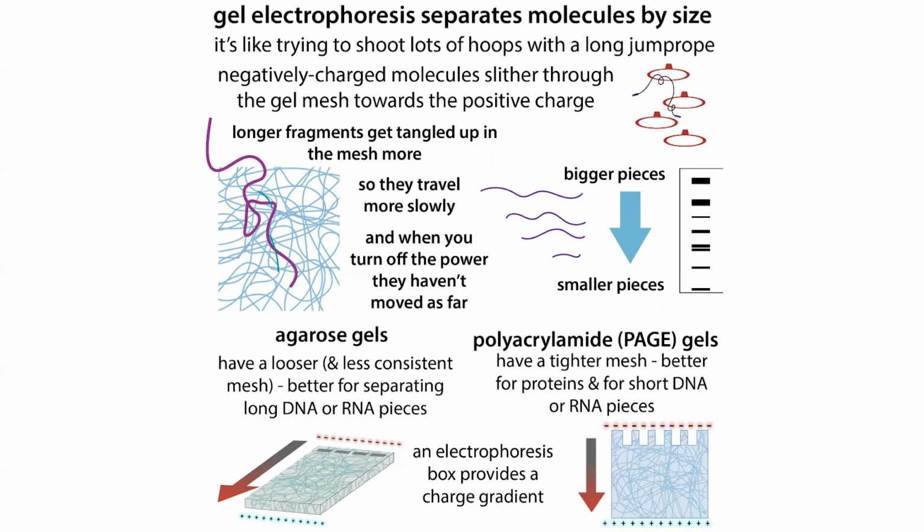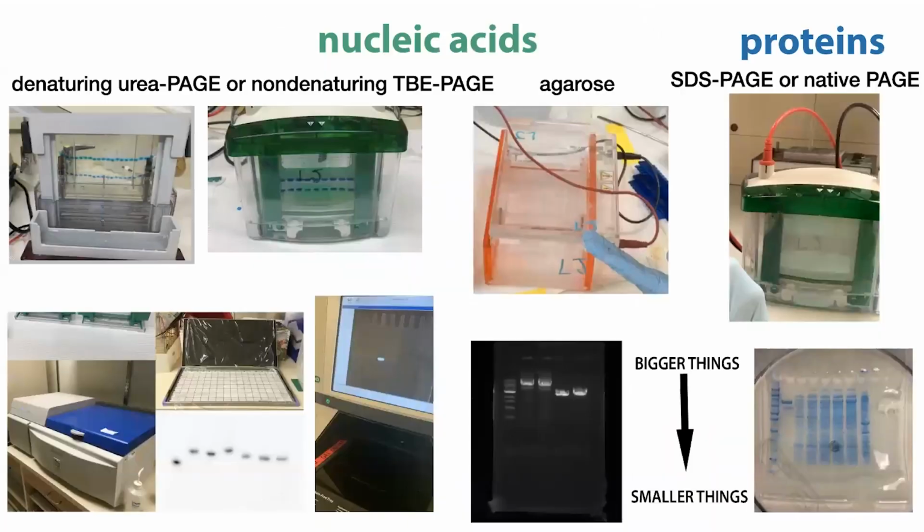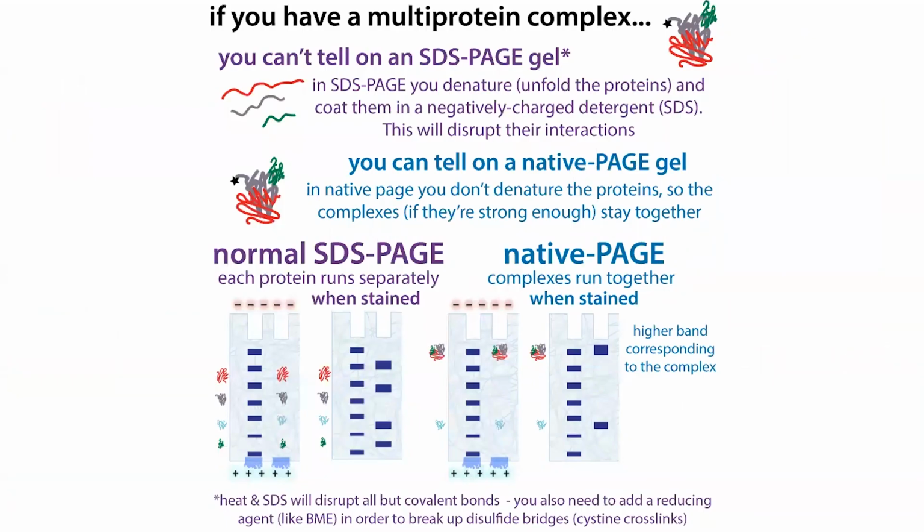And then if you were to stop your gel and look to see where the molecules are, even if they had the same molecular weight, the same length, they would be in different places in the gel, and then you would get really confused. They wouldn't match up with the ladder and things like this. So typically when we run a gel, we're using denaturing conditions where we're going to have them separate based on their length and be able to compare them better. But sometimes we'll want to keep things non-denaturing or native so we can do things like see if proteins are interacting with one another.